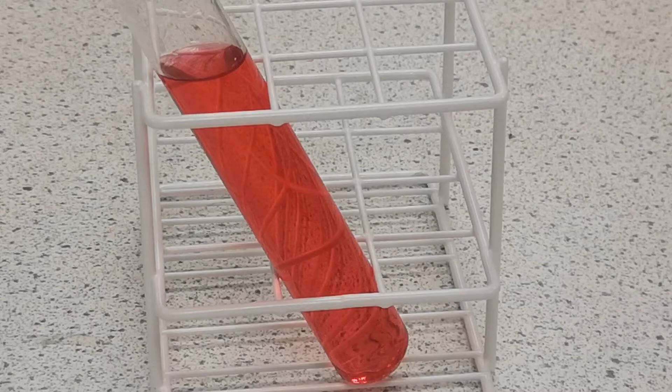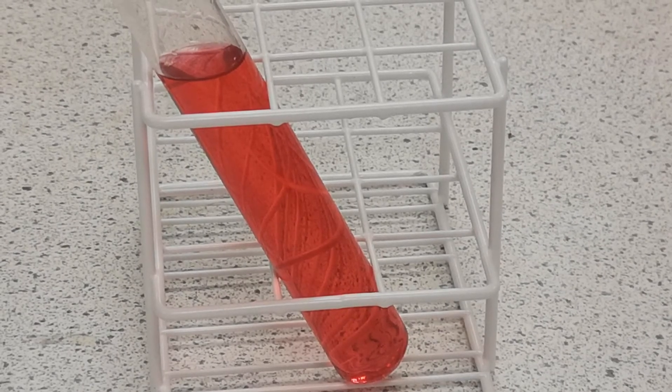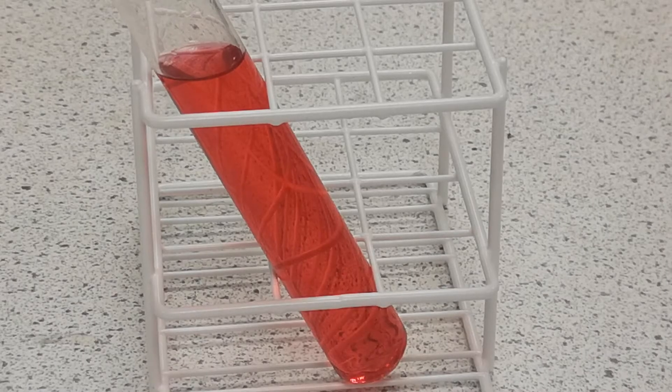Put some Universal Indicator in the bottom of your container. I'm using a test tube, but a measuring cylinder is a more normal scale. Then you fill this with very dilute acid — I'm using here 0.05 molar hydrochloric acid. Adding the indicator first just means that it will mix without you having to invert it.